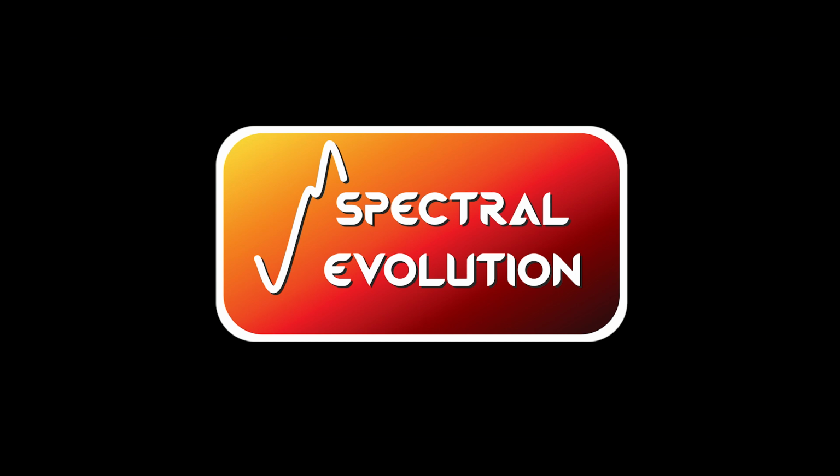Another question is, can this adapter be used with any instrument? As Mac showed, you can use this with any Spectral Evolution instrument. However, the sensitivity of the instrument makes the difference in the quality of your data.